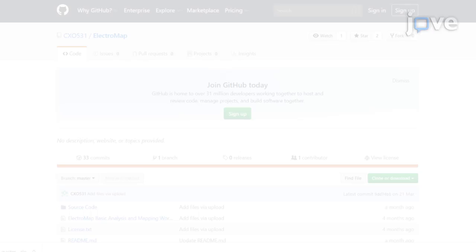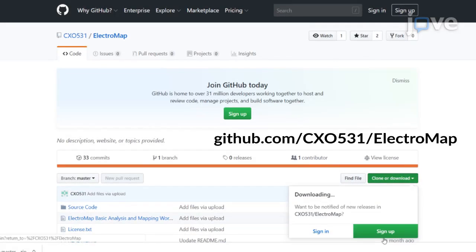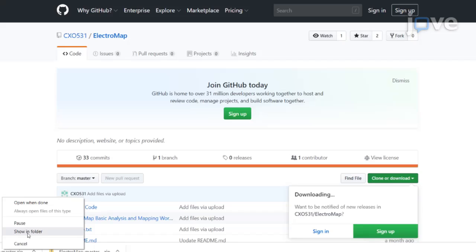Begin by downloading all files from the latest source code release of ElectroMap from the GitHub repository. Unzip the downloaded contents to a desired location.